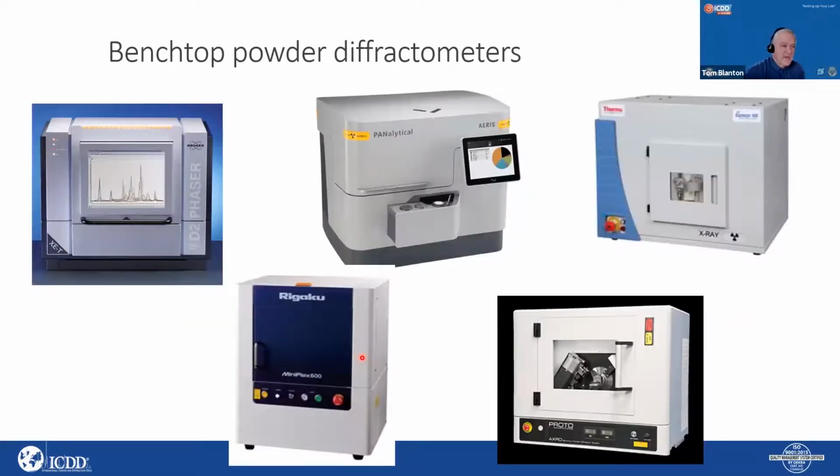Very popular today are the benchtop powder diffractometers. These instruments, as the name states, can sit on a typical laboratory benchtop. They have a much smaller footprint. The facilities requirements tend to be easier to deal with compared to the larger instruments.